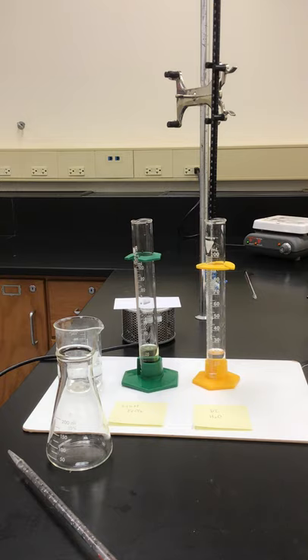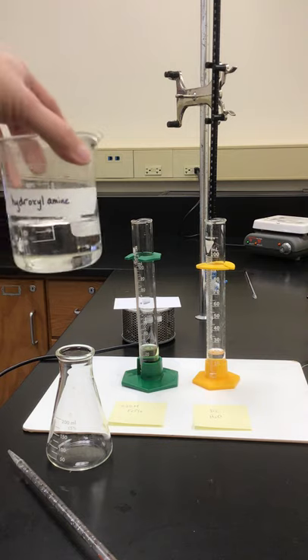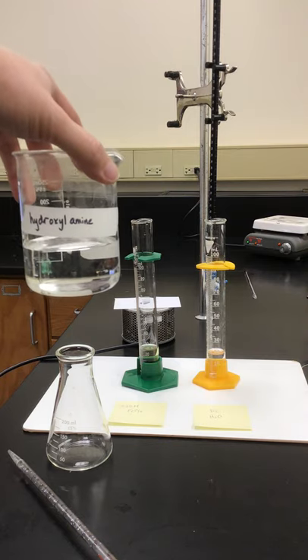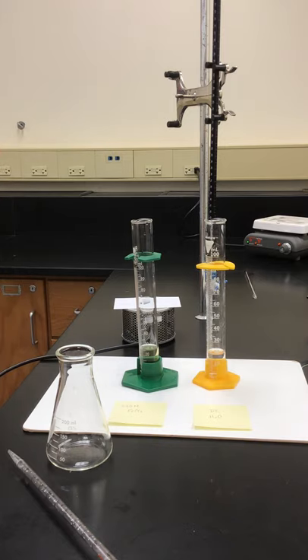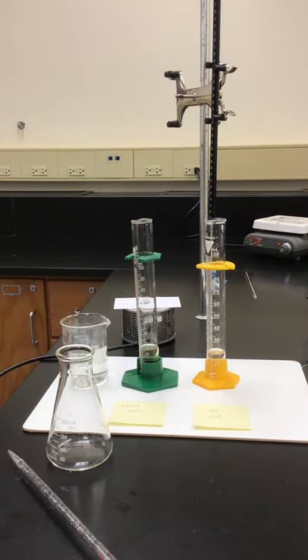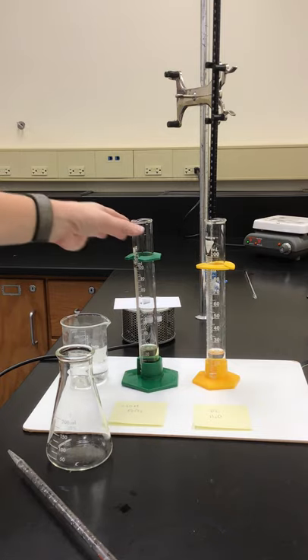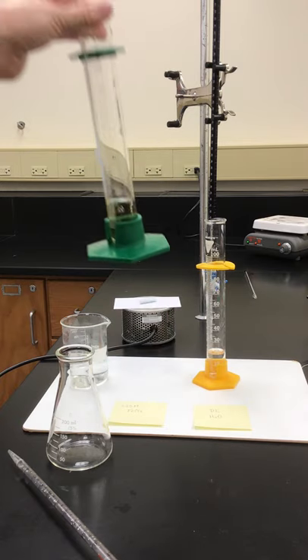The directions in the handout tell us that we are going to be pipetting some hydroxylamine — that's the stuff we're going to do — 10 milliliters of that, pipetted into our Erlenmeyer flask. Then we're going to react that with some iron(III) chloride, which is this yellowish-looking solution, and some water.